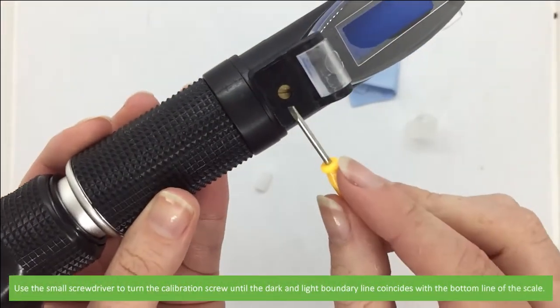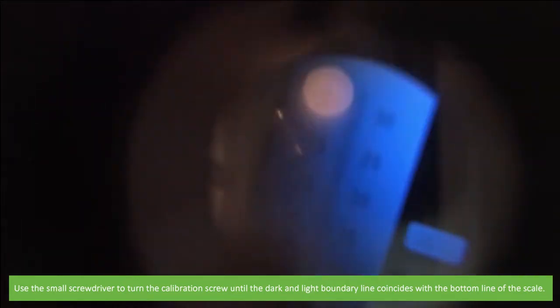Use a small screwdriver to turn the calibration screw until the dark and light boundary line coincides with the bottom line of the scale.